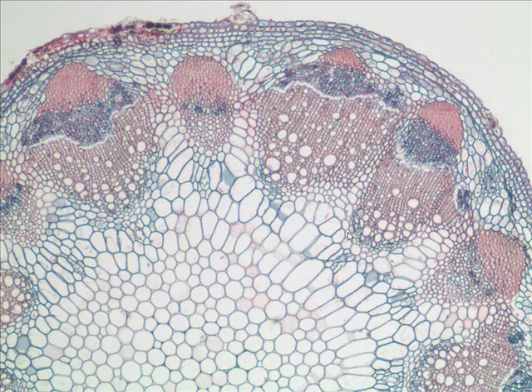All right, let's look at the real stem. And I believe this is sunflower, and we can see epidermis on the outside. We can see what's this layer just inside the epidermis? It is the what? Collenchyma. We see the vascular bundles. Wow, what do we see on the top of the vascular bundles?